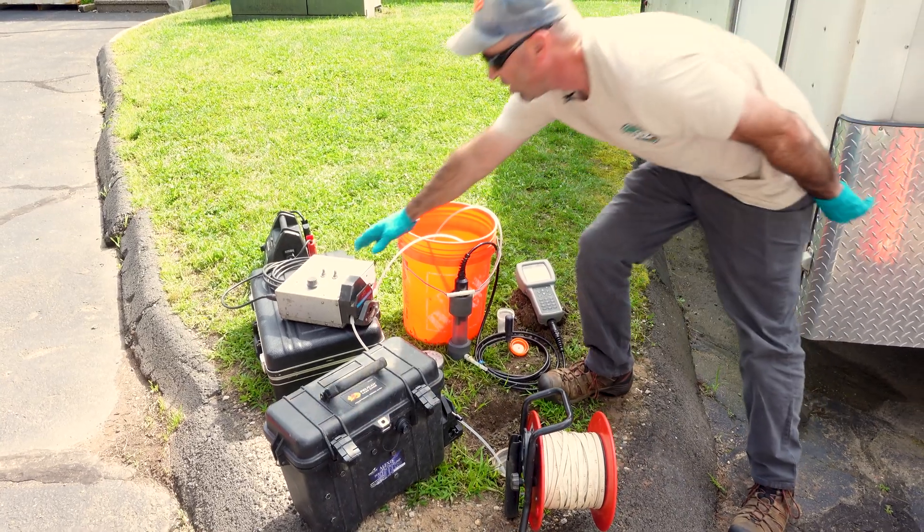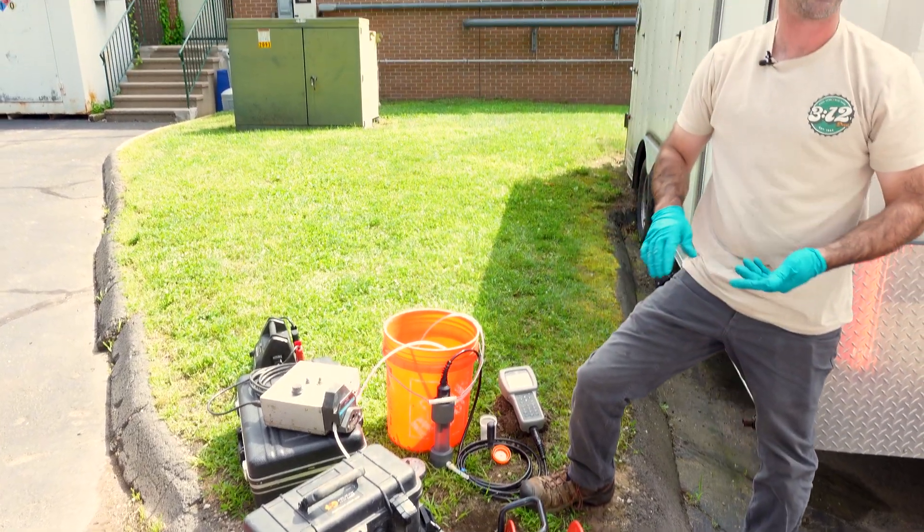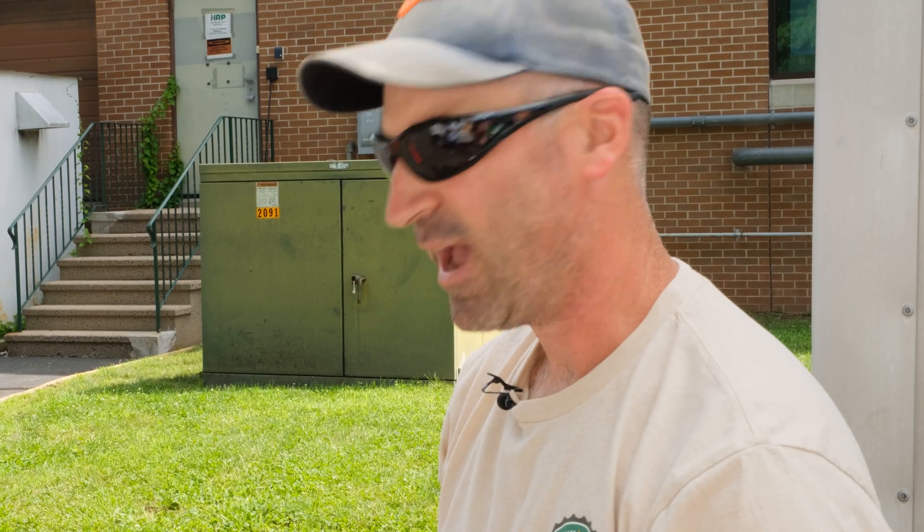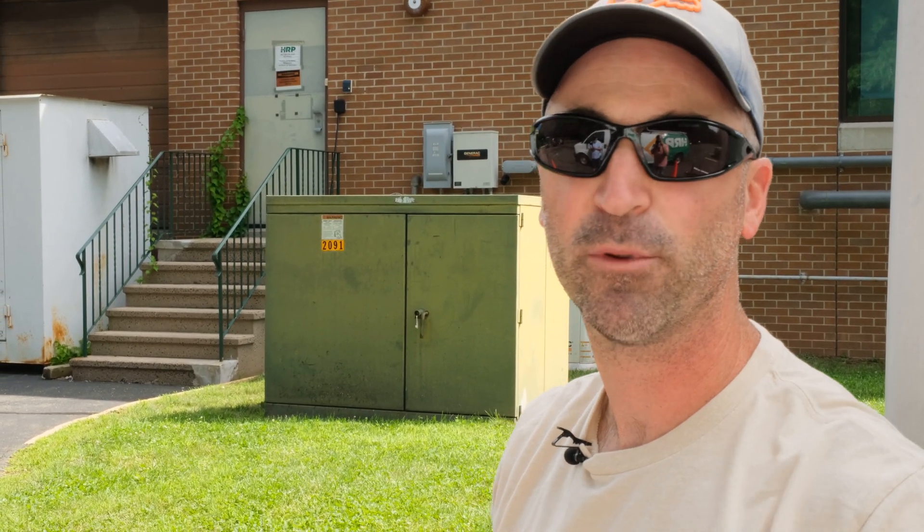These peristaltic pumps are only good to about 25 to 30 feet depth of water — beyond that they cannot overcome the atmospheric pressure, and you need to use a different style pump like a bladder pump or a submersible.